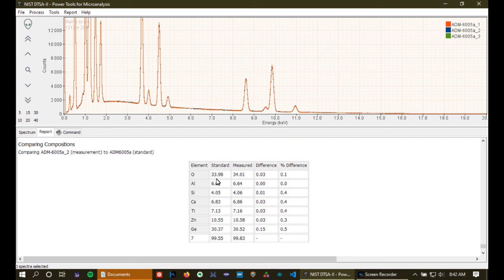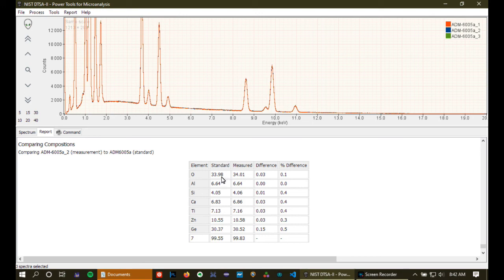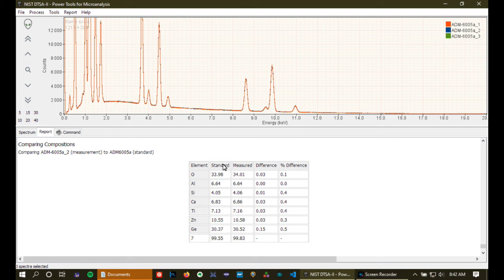And we can see that these are looking pretty darn good. For example, for this particular number two, we measured oxygen to be this. Or this is the known composition of oxygen, this is the measured. And you can see that the level of agreement is very, very good. So, that suggests to me that we've created some really nice standard bundles.